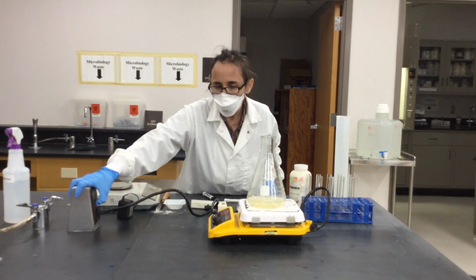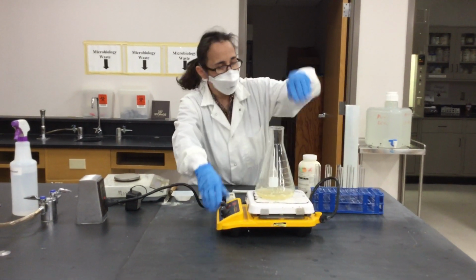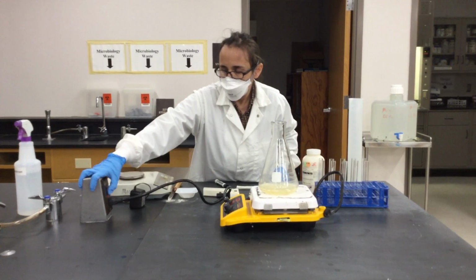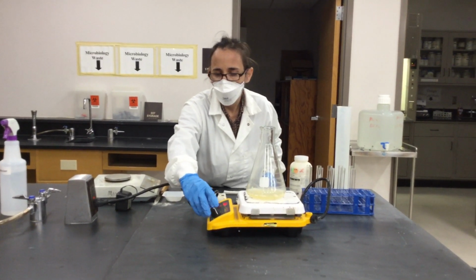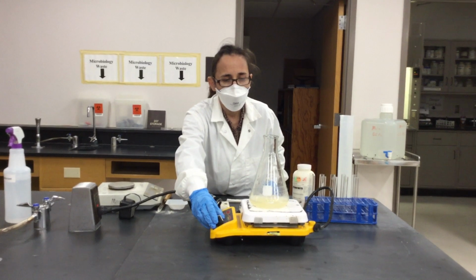And once the agar is melted, you will pour that agar into your test tubes, and then you will sterilize it in the autoclave.